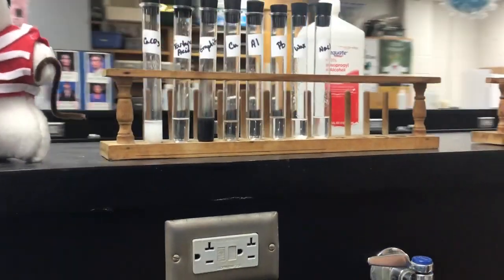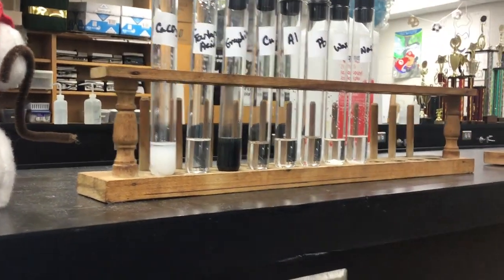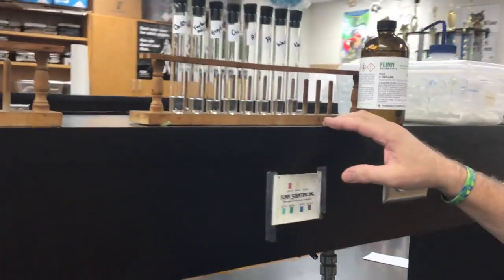So let's go back and look at each one of them after they've sat for a little bit. Hasn't been very long, obviously, but let's do it at the very end. Let's go do the other solvent, and then we'll go and look at all of them separately. That'd be a good idea.